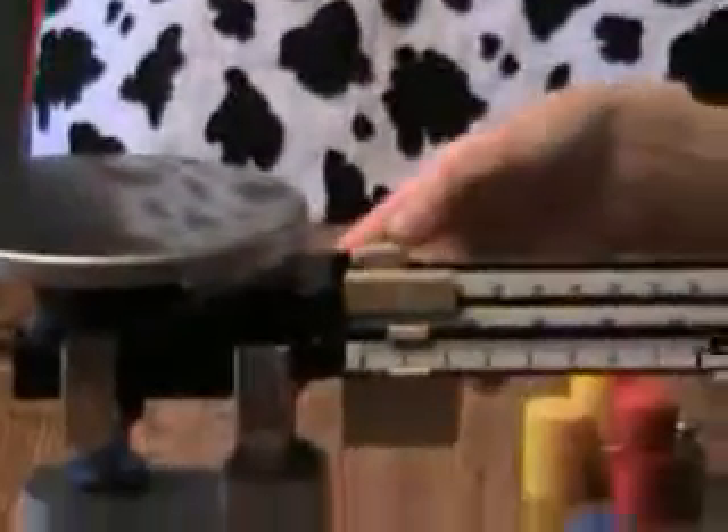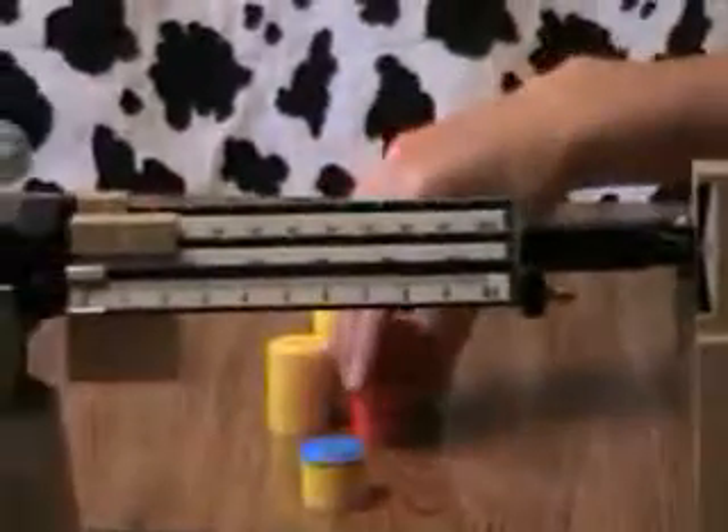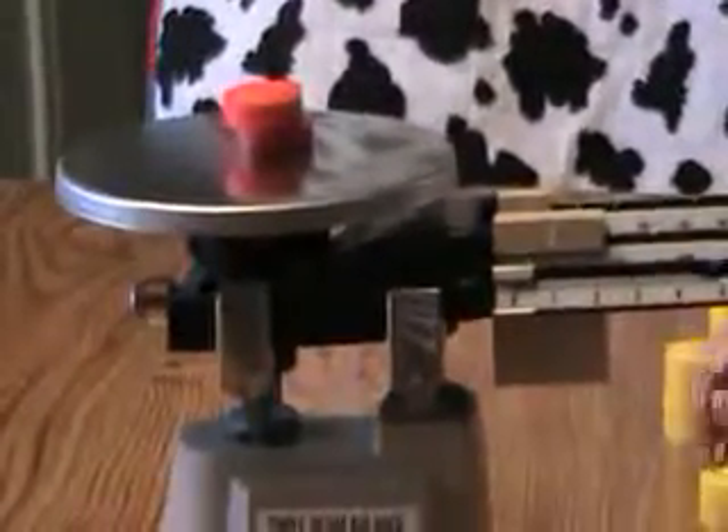Let's try again. Move my weights back to zero and make sure it lines up.